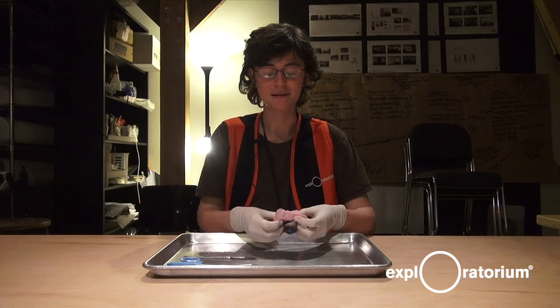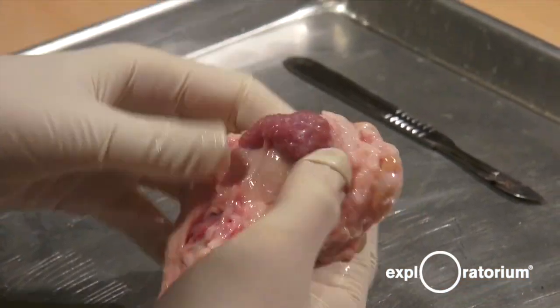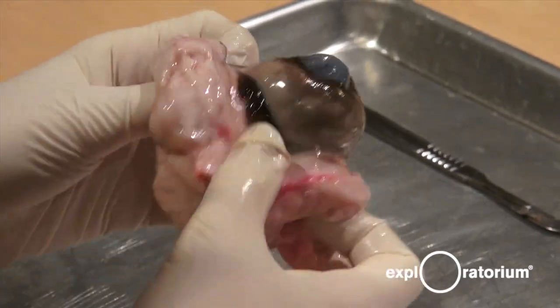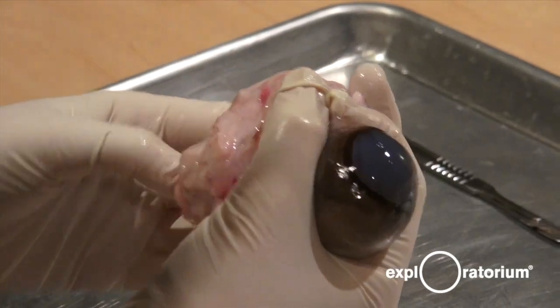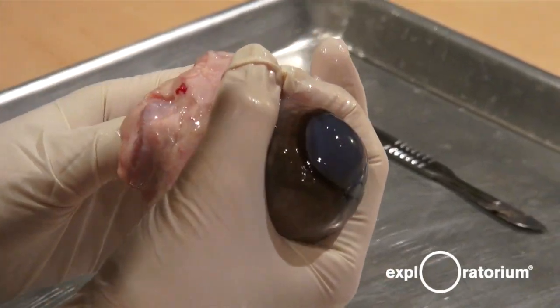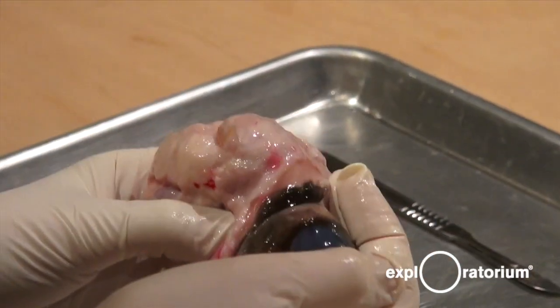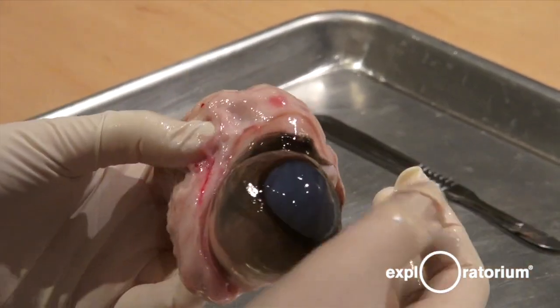We'll start with the outside of the eyeball. Here we have some muscle tissue, and this is useful for looking around. But cows can actually do something else with their eyeballs that we can't. They can actually pull their eyeball back into their socket a little bit, so that this thing called a nictitating membrane, or third eyelid, can cover their eyeball so that they can be protected when they're grazing, because grass can be very, very sharp.